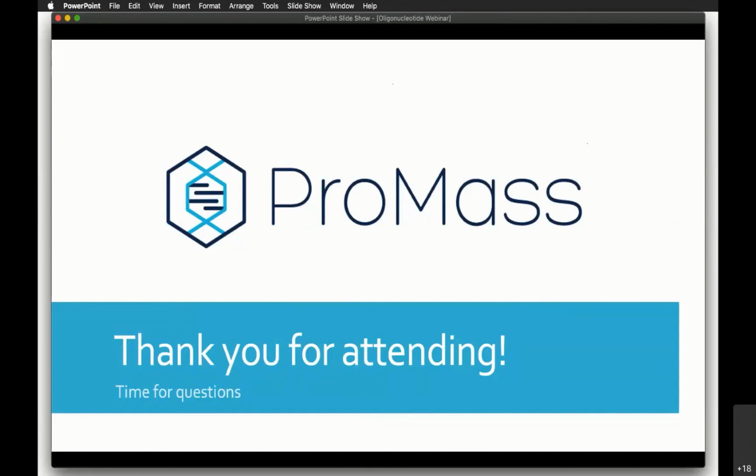Okay, and I guess I potentially missed it for a second. You said that when calculating your purity, the adducts are accounted for, as long as they're listed in your deconvolution peak report. Yeah, so I probably wasn't as clear as I should have been there, but essentially, if ProMass finds an adduct, it will list it in the report and say, hey, I found this. But when it actually calculates the purity, it will not include the adduct in the calculation. It knows to exclude those adducts because it knows that they're not an actual part of the sample.